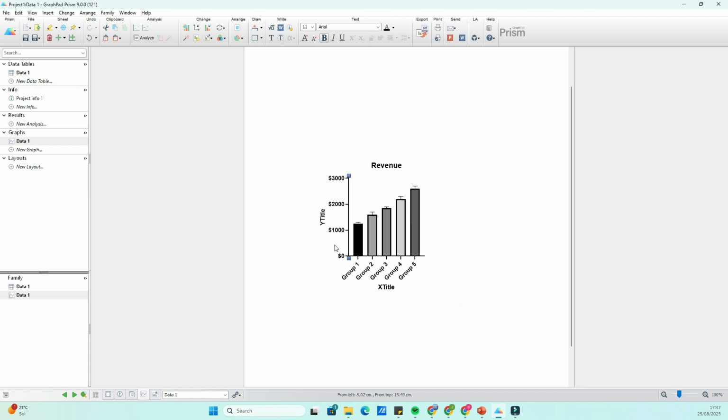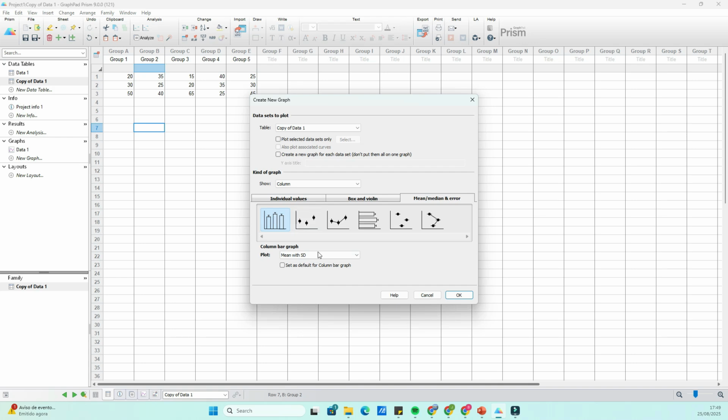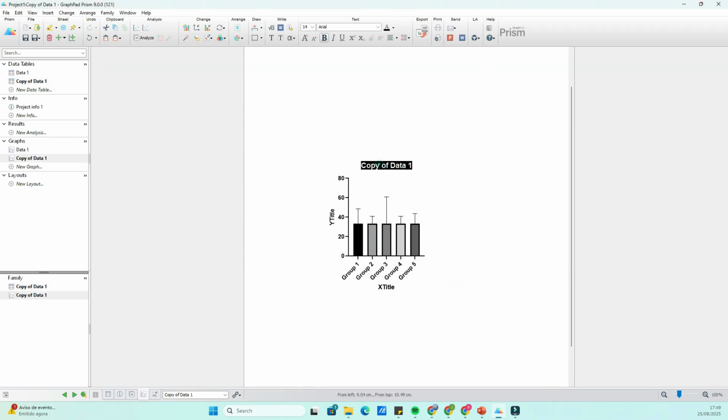Now let's try it with another graph, but this time adding a percentage sign. As in the previous example, you generate the graph, double-click on the y-axis, but this time you insert a suffix rather than the prefix for the percentage sign.